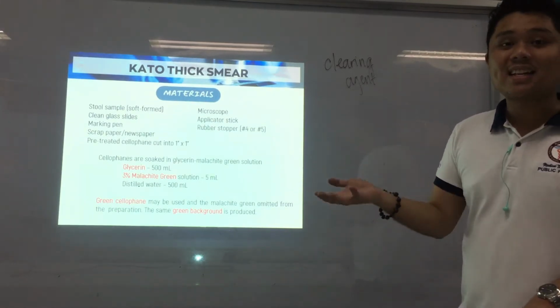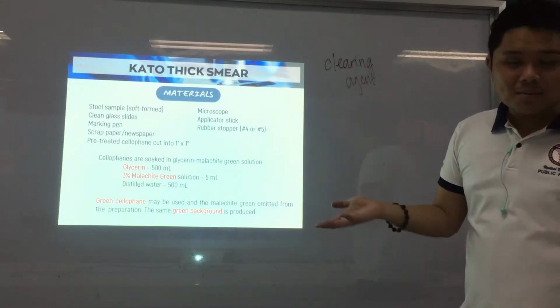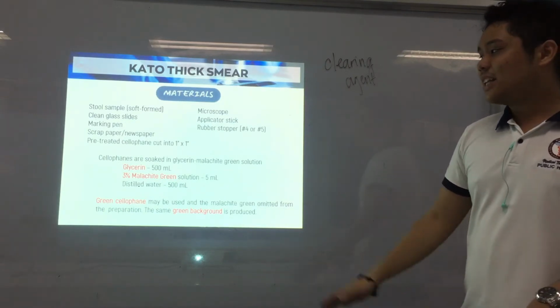So, di ba, it's easier to identify and examine because there are no other sagabal, or no other artifacts that could confuse you. Alright? Okay, that's the purpose of glycerin.